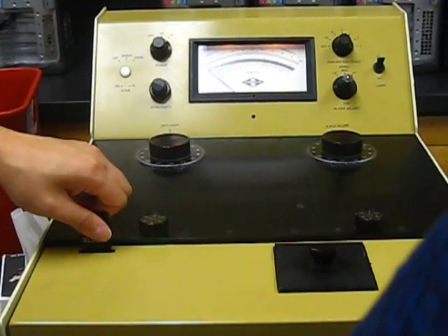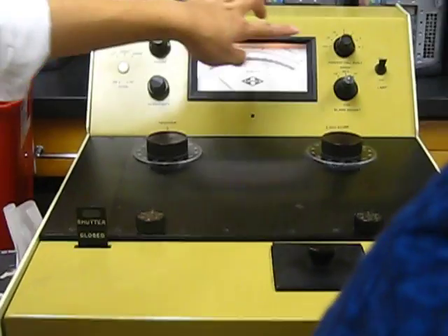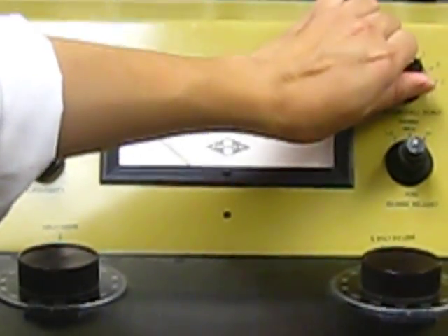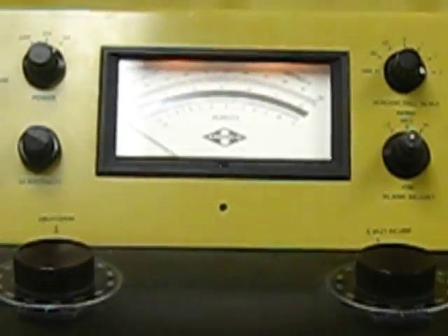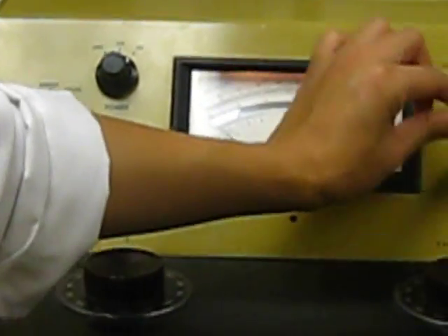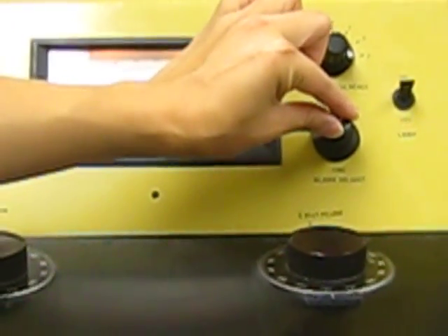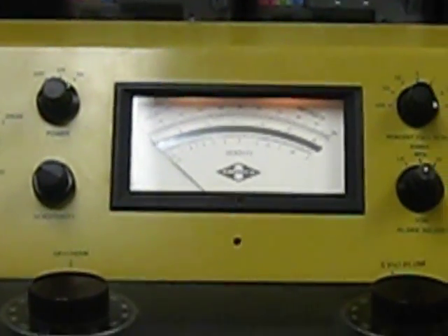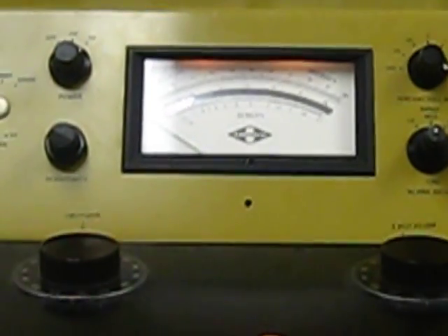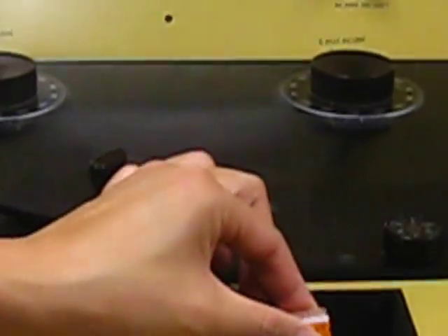And because this is the blank, we want the needle to be 0 even at the highest sensitivity. So we put it to 0.1 and open the shutter and adjust the blank to 0. Now it's 0. Now it's okay. We close the shutter. After we set up 0 by the blank, we'll put the first sample inside.